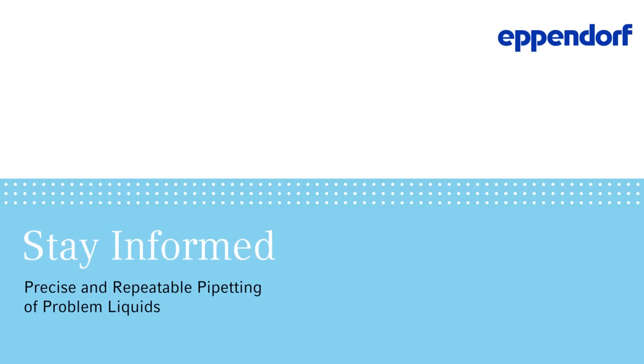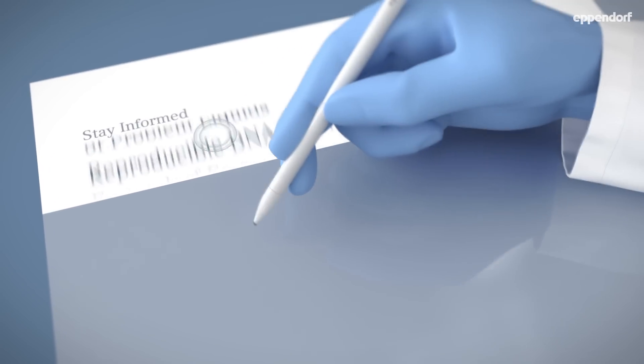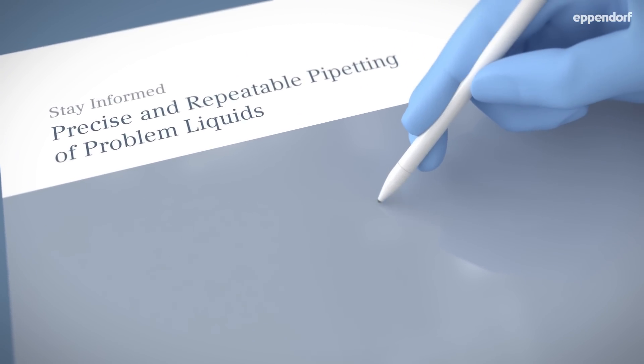Welcome to this tutorial video. I will show you some easy ways to improve your pipetting skills and avoid problems. These techniques can help you get better and more reproducible results. That's what science is all about. So, let's get started.